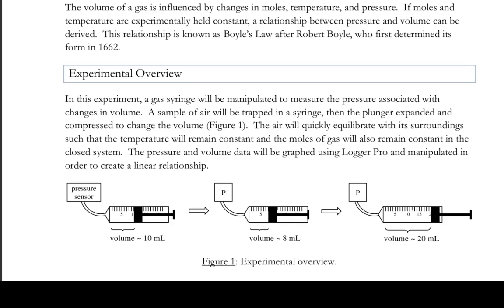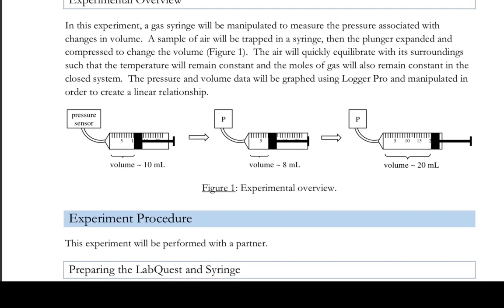And we will measure its pressure, and then we will push the plunger in and measure the pressure at those different smaller volumes. Then we will pull the plunger out, and we will measure the pressure at those different volumes.